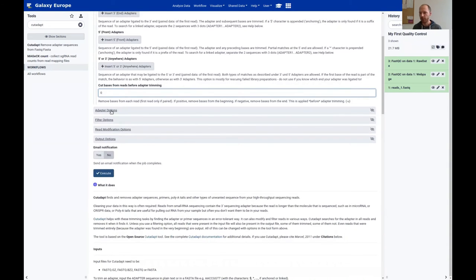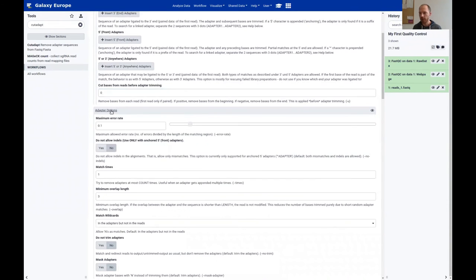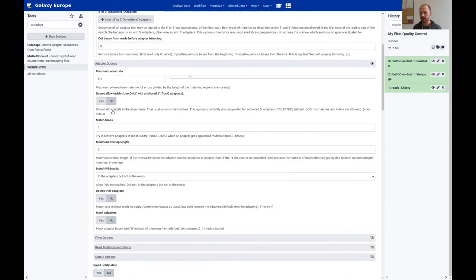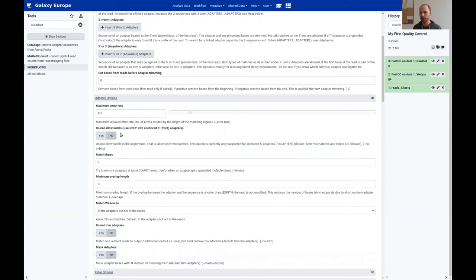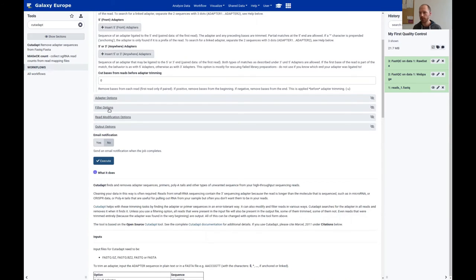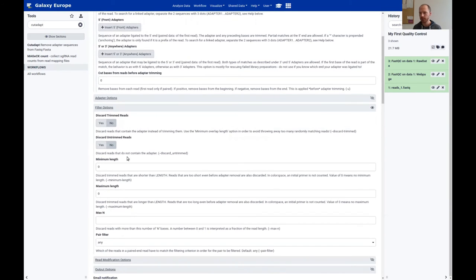You can also cut bases from the 5-prime end before adapter trimming — useful if you know there are molecular identifiers in your read data. There are further options, but I won't explain them in detail; take your time to read through them.